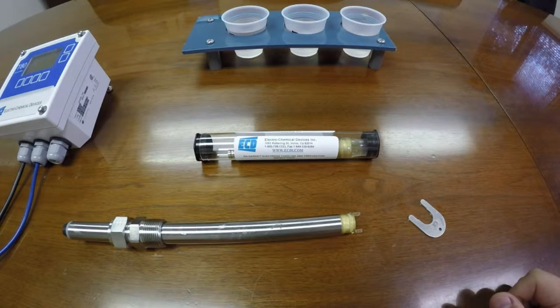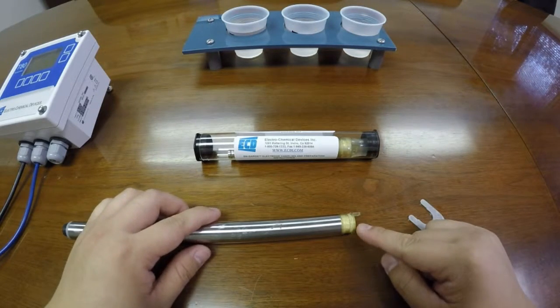Welcome to Electrochemical Devices. Today we will be replacing the pH electrode. The following steps can be done for any of the electrochemical devices' lines of replaceable electrodes. This ranges from pH, ORP, galvanic DO, and specific ions.